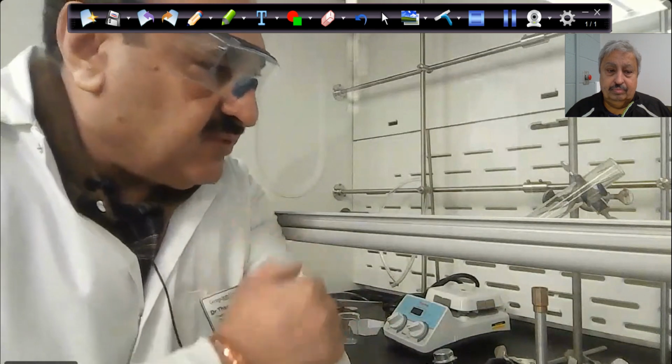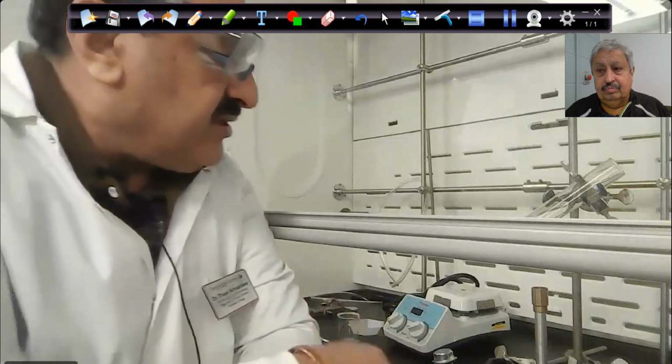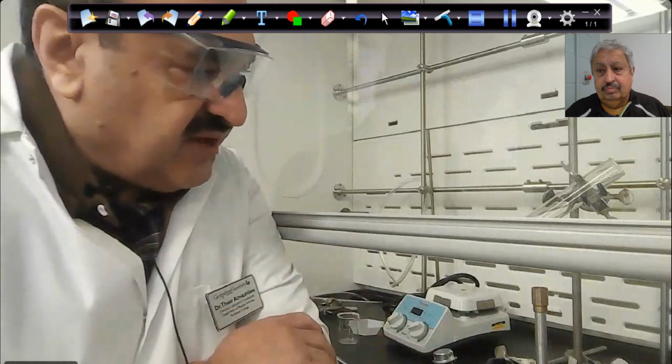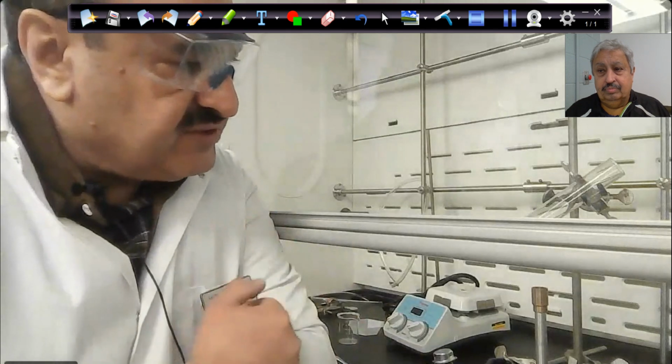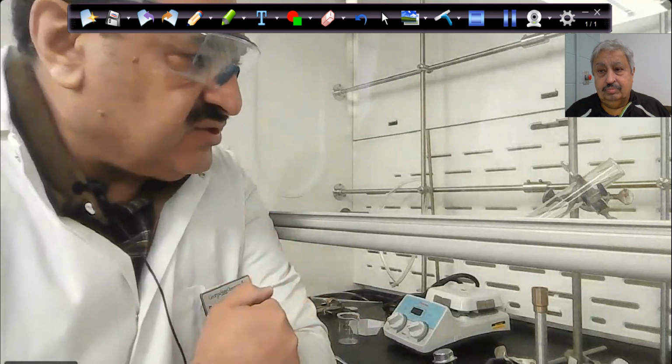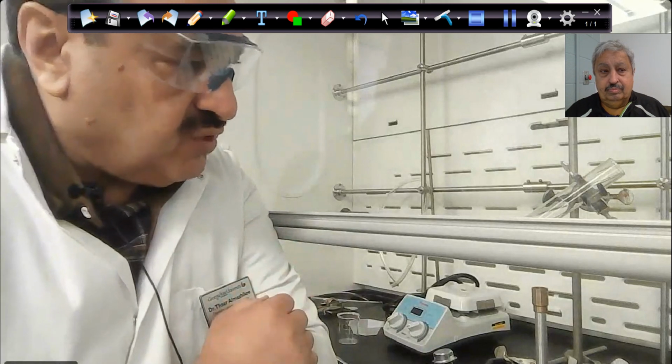Doing the same thing, clamp the test tube again on the clamp and heat it up for another 8 minutes. And once it cools down, take the difference between the first and the second one, and you should get a difference between the two measurements within 0.05.